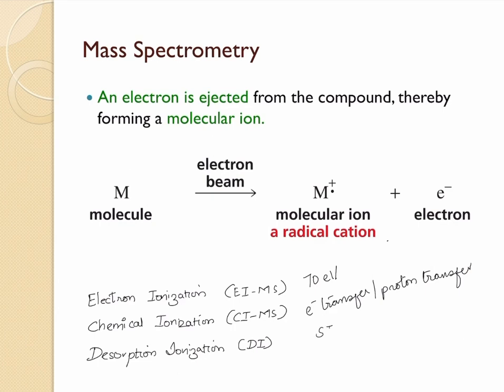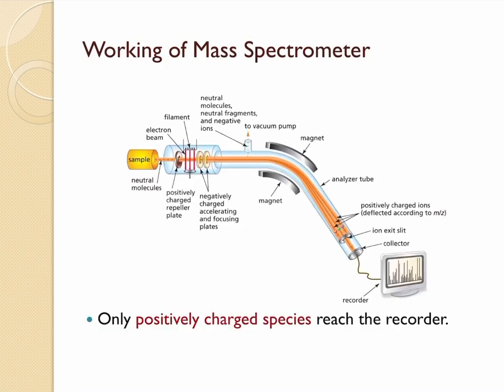The first one is SIMS. SIMS uses a high energy beam of ions, also called secondary ion MS. Or through photons, which we generally call MALDI. MALDI means matrix assisted laser desorption ionization. Or by neutral atoms, which we generally call FAB, which represents fast atom bombardment.